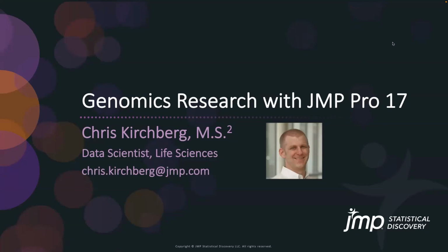Well, welcome everybody to today's JMP Academic Live webinar, Genomics Research with JMP Pro 17. I'm Ross Matusalem from the JMP Academic team. I'm just here to host and manage logistics today. Our speaker is Chris Kirchberg, a data scientist in life sciences here at JMP, a biochemist by training, and he's here to talk to us about using JMP Pro 17 to analyze genomics data.